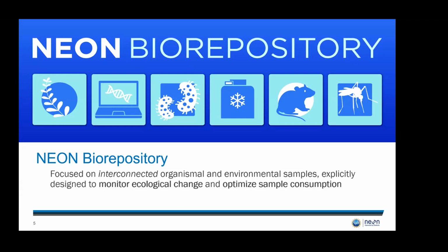What makes the NEON Biorepository very unique when compared to other specimen collection facilities is, one, the deliberate ecological interconnectedness of our samples designed to monitor ecological change. And second, unlike most, we have a primary objective to make those specimens available for consumptive research. So we really do encourage people to use and consume our samples.